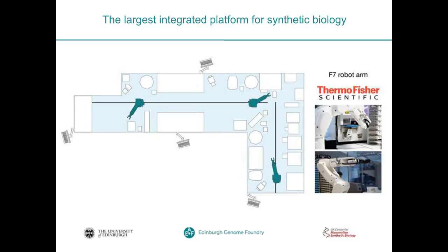I'm going to start off by showing you the robotic arms. These robotic arms are provided by Thermo Scientific. They are a repurposed Fanuc robotic arm. In a different setting, you would find these Fanuc arms spray painting your car or doing spot welds. But for us, these robotic arms are very flexible, and they enable us to have the reach that we need to be able to reach the wide range of instruments that are on our track.